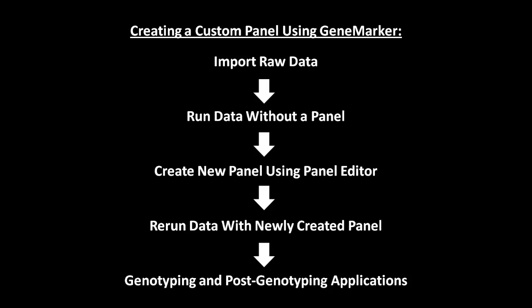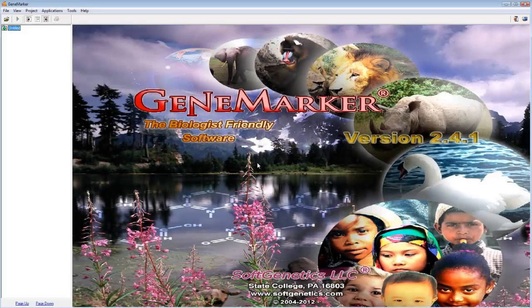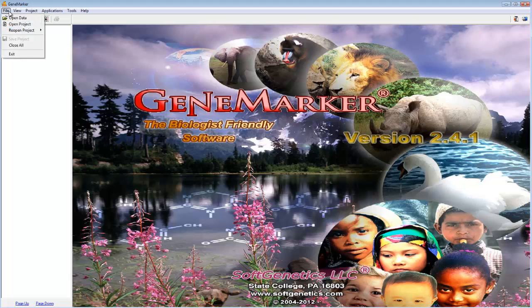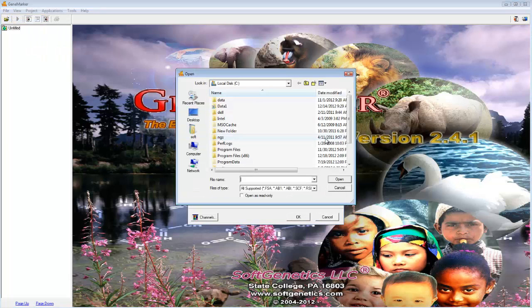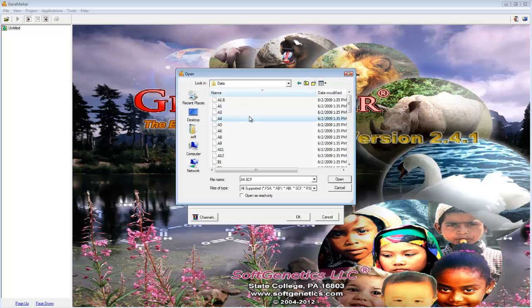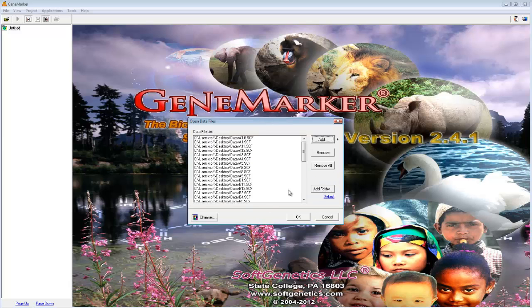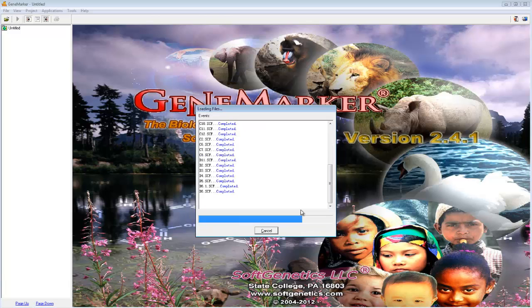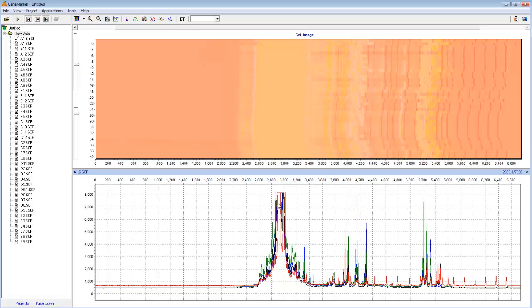I will now demonstrate the process of creating a custom panel. To begin, simply import your traces. Go to File, Open Data, click Add, and then navigate to your samples. Select your traces, and then click Open, and OK.